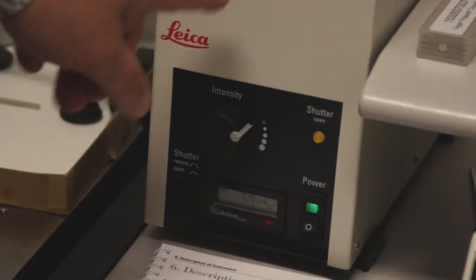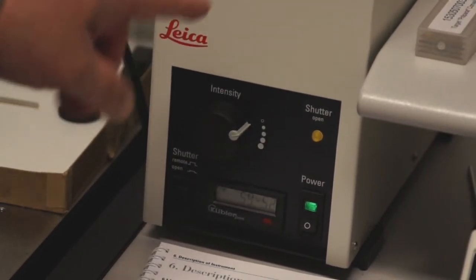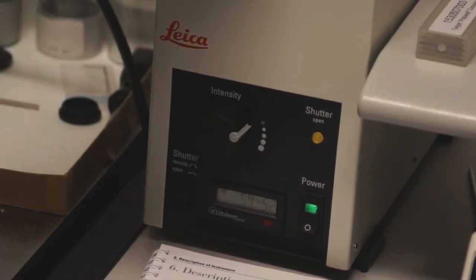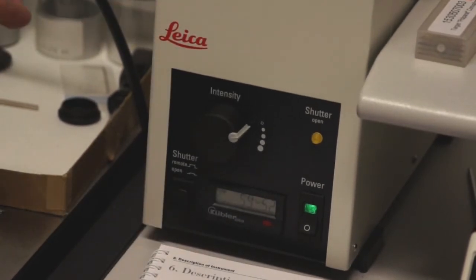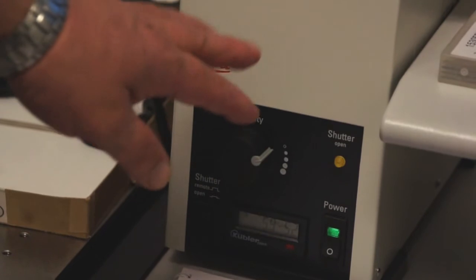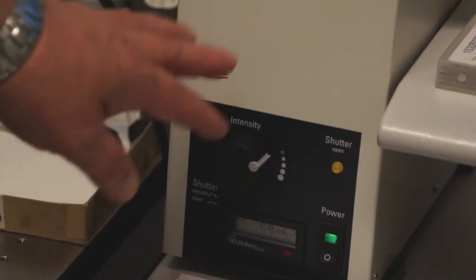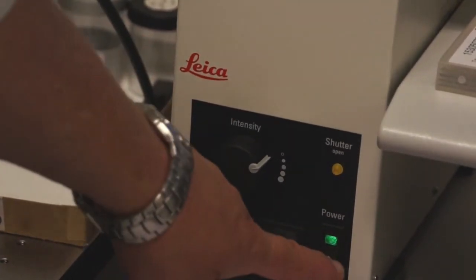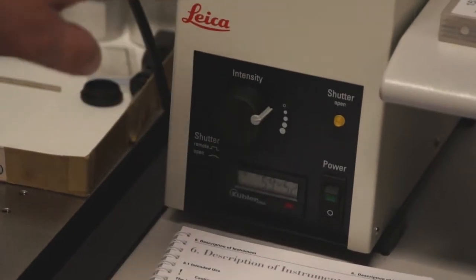Do not forget to turn off the mercury burner before you turn off the microscope. This is a very expensive bulb and the waveguide gel is very expensive. One person already left it on over a whole weekend and we had to replace a $500 bulb. So turn off the power on the front of the mercury burner lamp house.